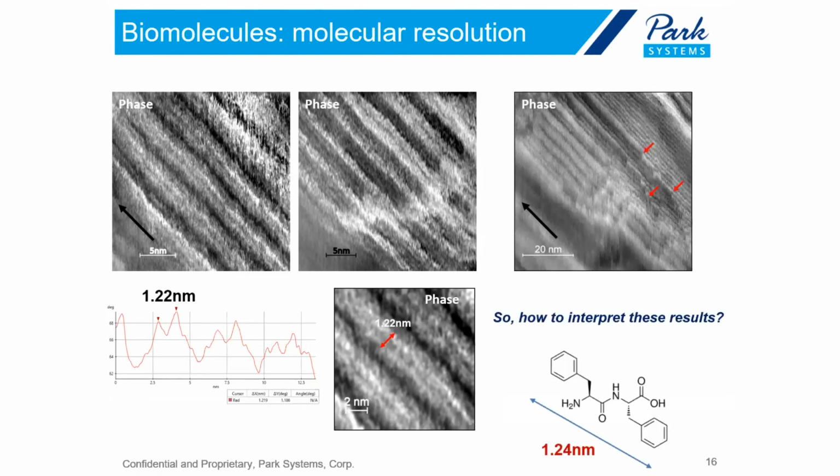The main question here, when it comes to complicated molecules and achieving high resolution, is this: you can get those high resolution images, but then there is a fundamental question of how do you interpret those results? Because you can't quite see the molecule as the molecule, because they often pack and interact in different ways that you simply do not know. So how do you interpret those results, how do you attach some chemical sense to that?